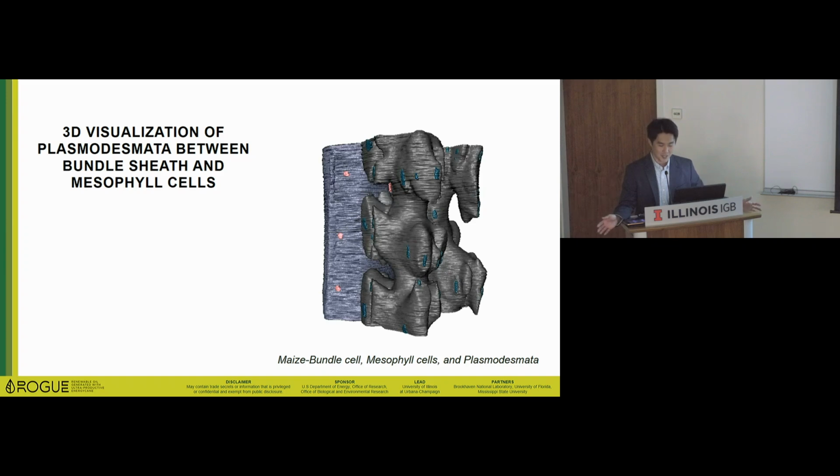SBF-SEM and TEM involve a dehydration step. It seems like Professor Lisa is worried about shrinkage or some sampling distortion. That's what she pointed out. I didn't show all of the information on this slide because we are currently trying to publish this data. So that's the reason we are concerned about the same thing.